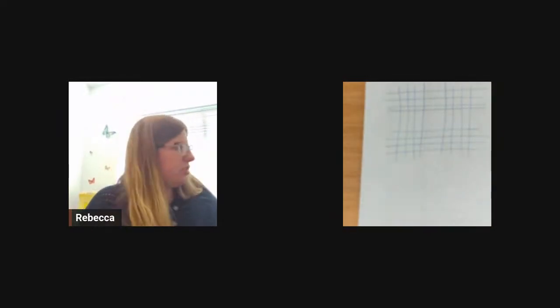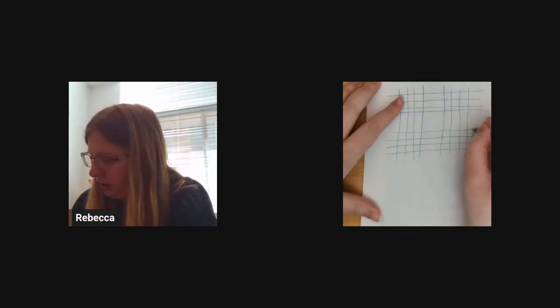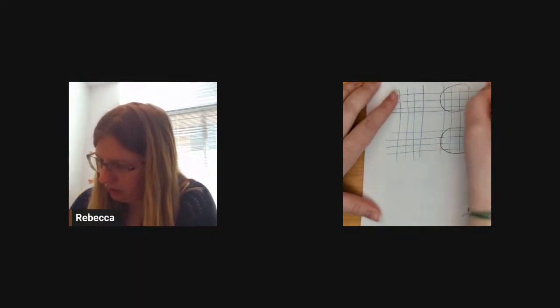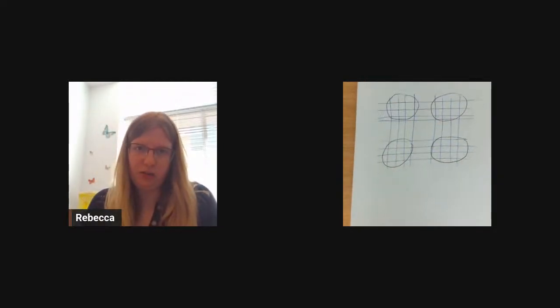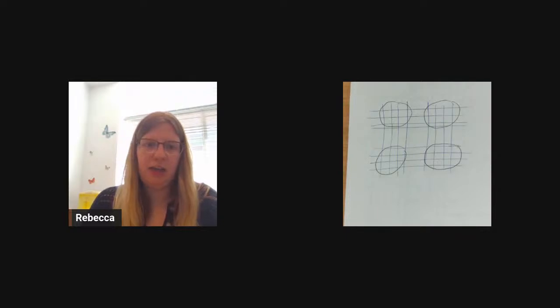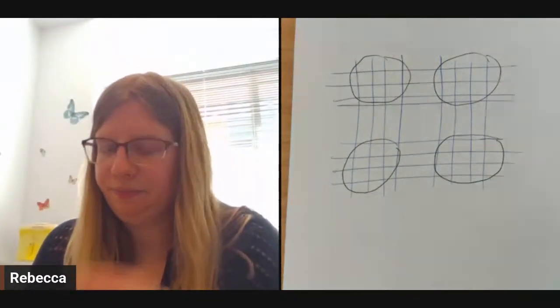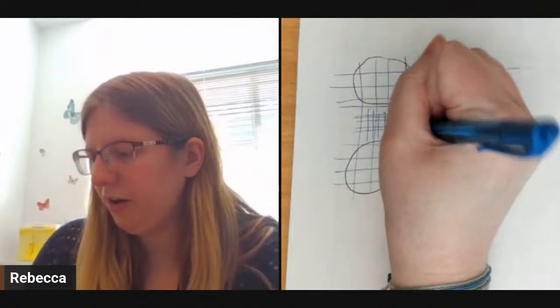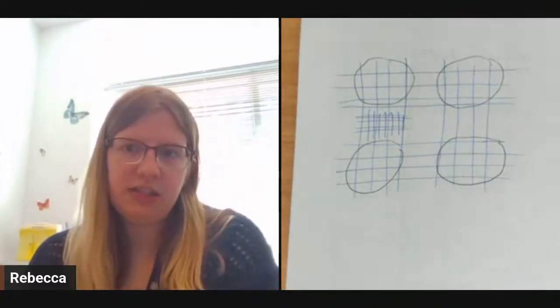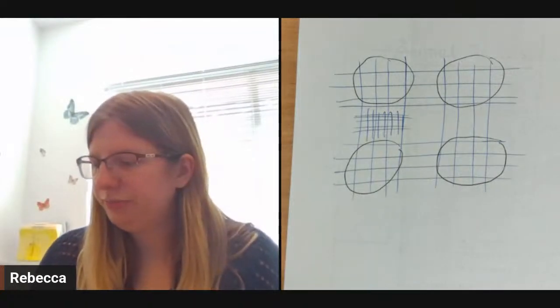And so our major squares, let me grab a contrasting color here, right, is 1, 2, 3, and those are the 4 corners that we're looking at. And sorry, my camera was smaller. In these other areas that I haven't circled, the lines are much more close together, creating more than 16 squares that you would read off of.